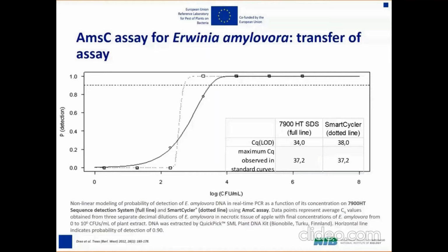The reaction anyway is typically 25 microliters, but also the reagents that are used can be even lyophilized, and that means that basically you can resuspend the lyophilized reagents in your sample, thus using really high volume of samples. And that can, of course, improve analytical sensitivity of a test. Again, what you put in can be detected. What you don't put in cannot be detected.